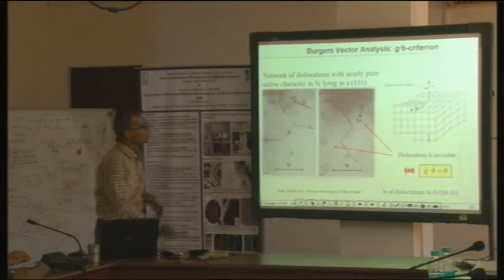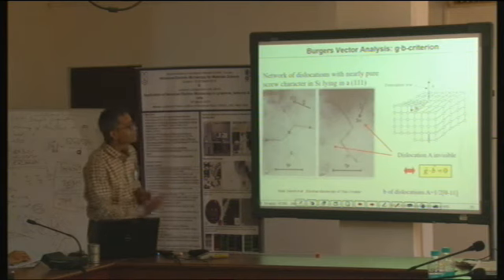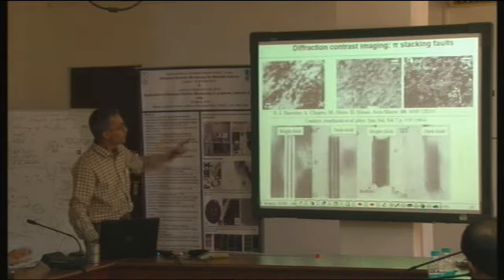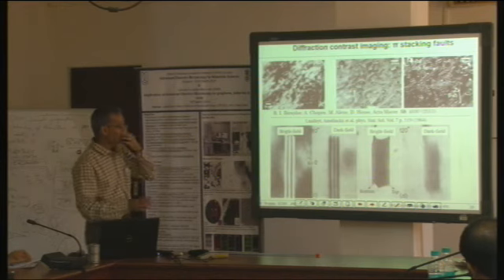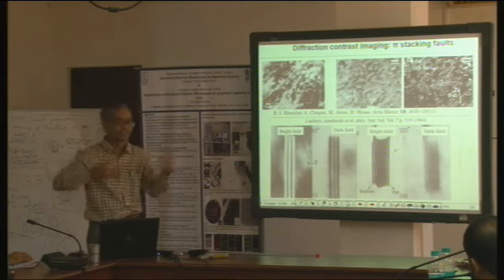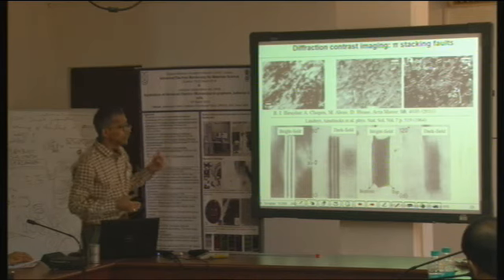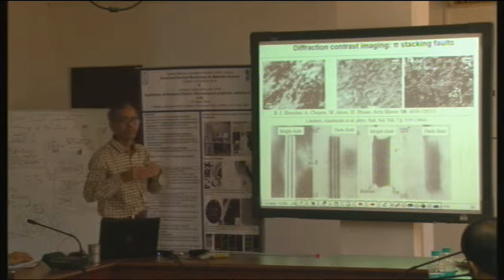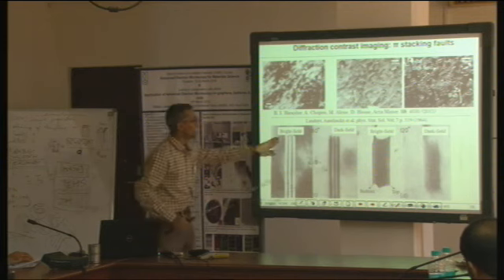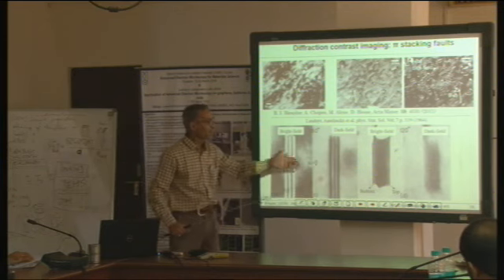However, this is a schematic diagram of a screw dislocation. This we have spoken of, and this was one example wherein any stacking fault, if it is there, will show fringes in the image, and how these fringes come up is also a matter of calculations. One also has to consider inelastic scattering effects, and there are reports for particular kinds of defects.